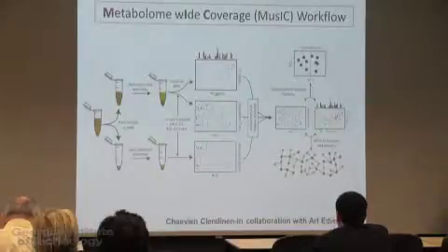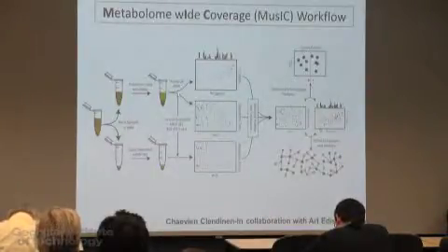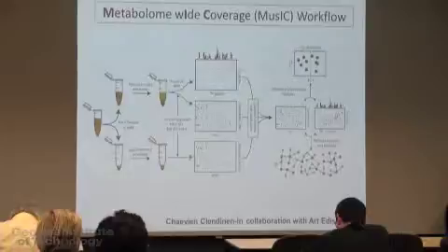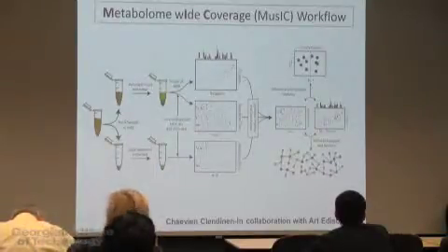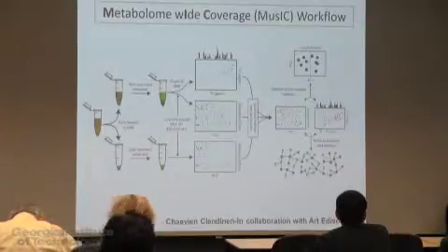The trick, like I told you before, comes after you combine this huge amount of data. What do you do with it? So Julia Kubanek and I had a project for 3 years, and I always joke that we collected data for 8 months, and we spent the last 2 years deciding what to do with that data because it was so much, so complex, so careful what you wish for. In that case, we actually had metabolomics, mass spec and NMR metabolomics plus proteomics data on the same system, and it got so overwhelming, okay? So careful how far you want to push these things.